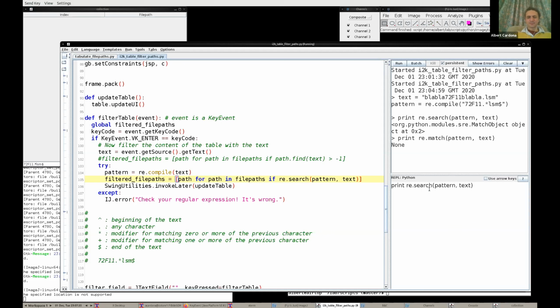And then fine, this matcher. Wouldn't it be find? Find all? That is in Java, not in Python. So even though this Python one is implemented using the Java one, still it uses the Python convention. So this is re search. And then, come on, this returns a matcher.